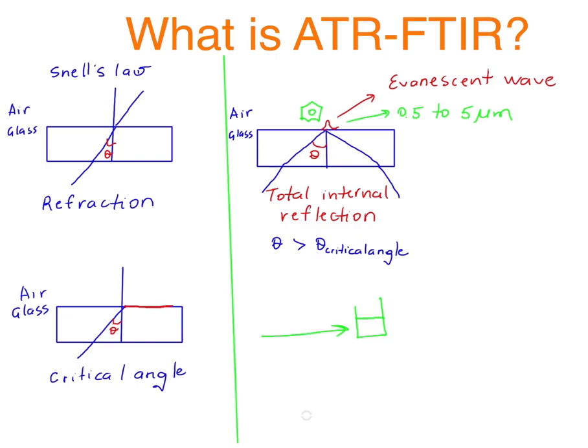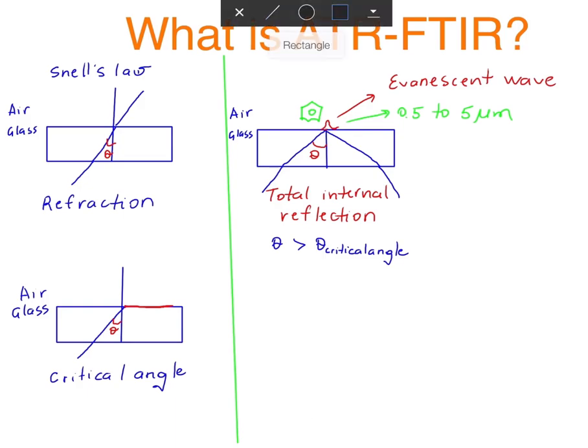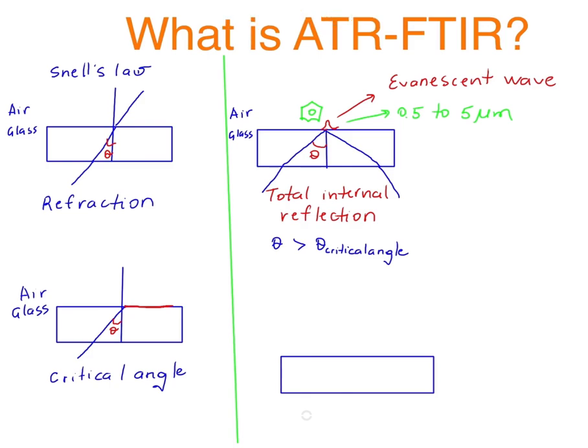We may ask how a molecule absorbs. I briefly mentioned it earlier, but I'll go through one more time how exactly it absorbs. Again, I'm going to redraw here our crystal, and of course we have the total internal reflection. It goes in that direction, it comes back there. We have a sample here, and a small light that's propagated.